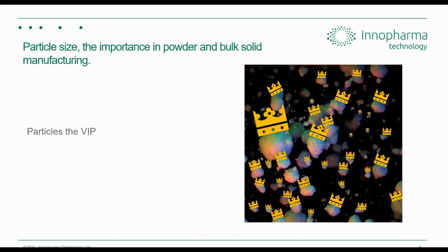The link between particle size and product performance, again, is well documented. It's not what we're going to cover here today, but there are plenty of studies out there on how particle size affects things like dissolution, a study we've done ourselves, absorption rates, content uniformity, etc. So by monitoring and controlling particle size, you're ensuring consistency. And that's the goal in manufacturing. You want a consistent, high quality product so you can compete.